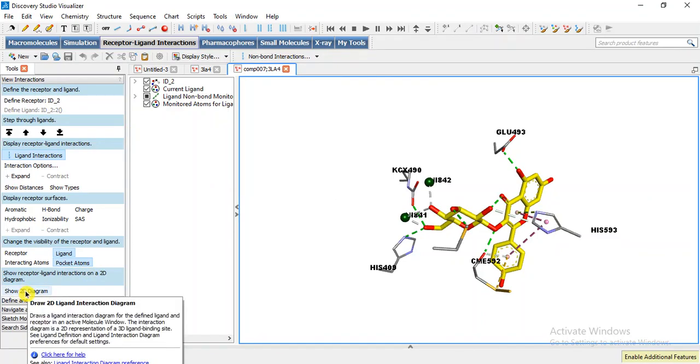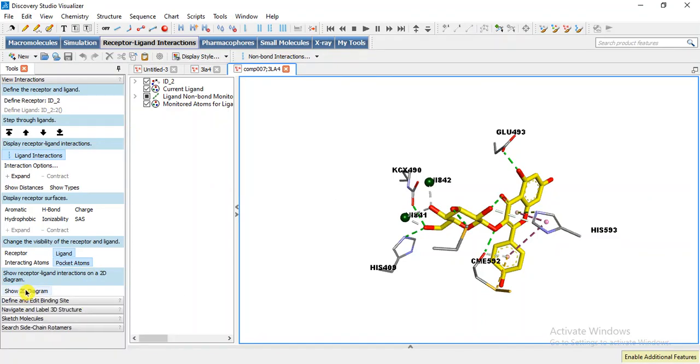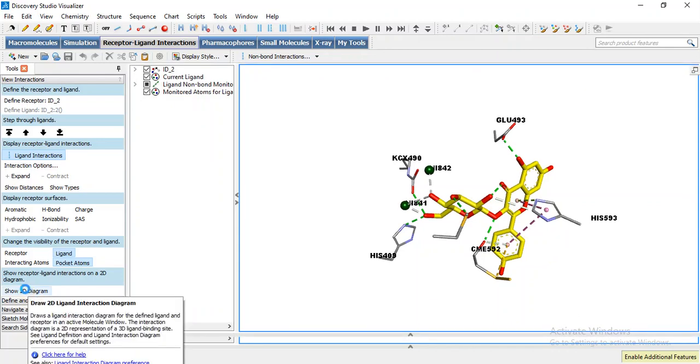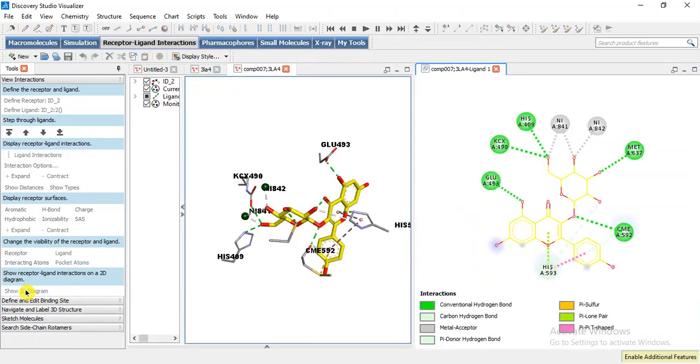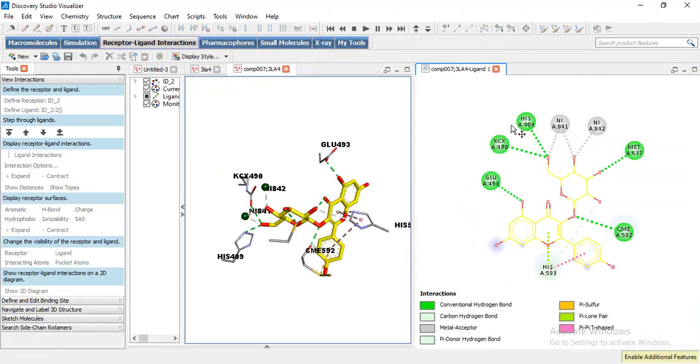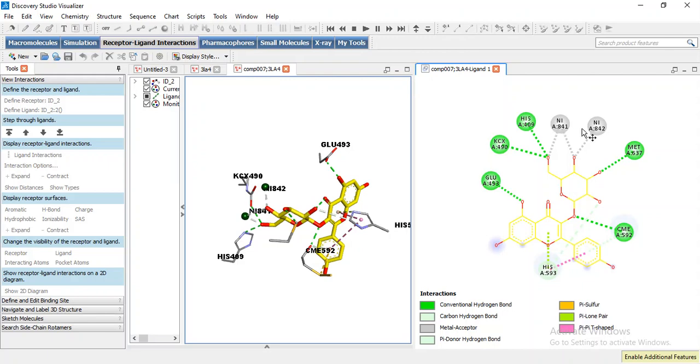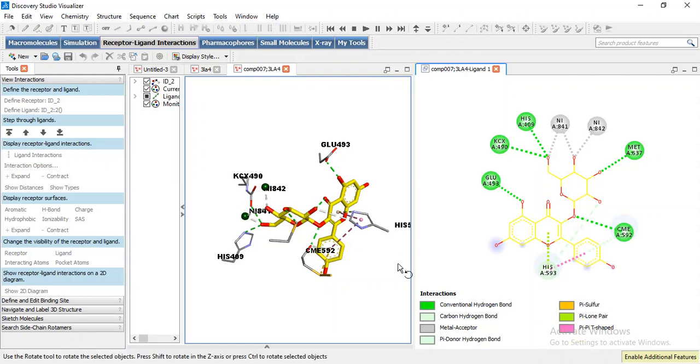Here we will move to Show 2D Diagram. Now it has opened our 2D diagram of this 3D interaction which represents the covalent bonding and interaction with nickel atoms which are present inside the urease. This is the active site of urease and these are other residues and interactions. All these types of interactions will be shown here.